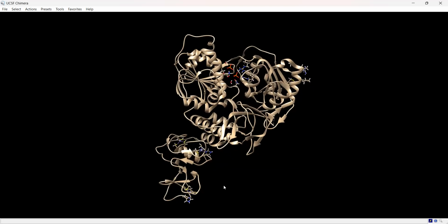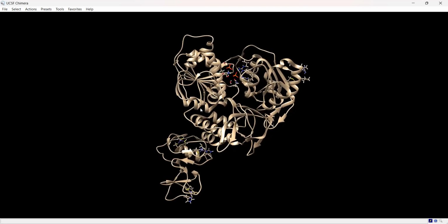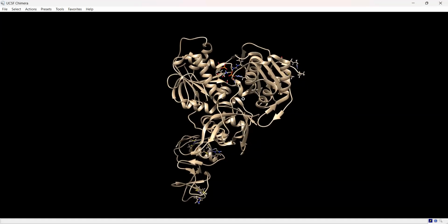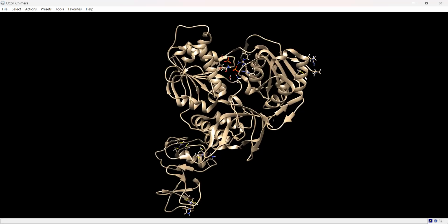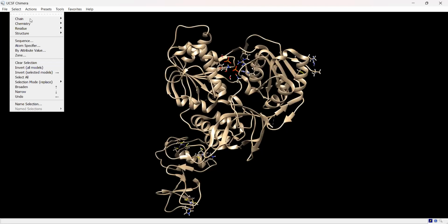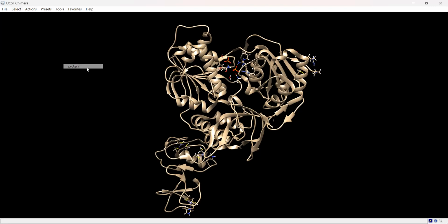Now we need to do the same for the ligand. What you can do is go back separately. So before we did the dock prep, when you had the protein and the ligand, you essentially do the same procedure, except rather than selecting the ligand and deleting that, you select the protein. To do that, you're going to select structure, protein, and that will select the protein but not the ligand, and you can delete that and then run through the same procedure of dock prepping afterwards.